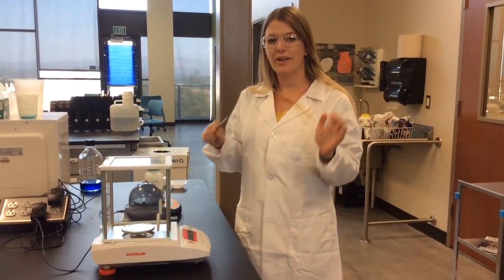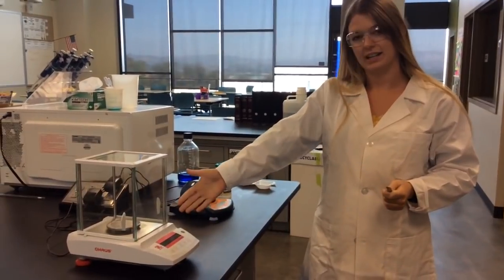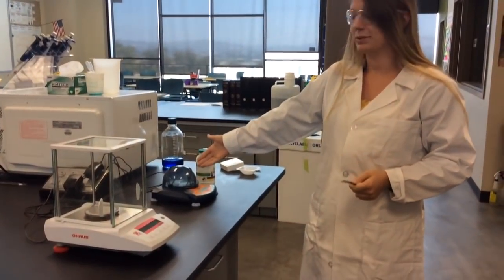Hi everyone, it's Ms. Martin, and we are going over balances. The first balance we have is our analytical balance, and the second one is our tabletop balance.